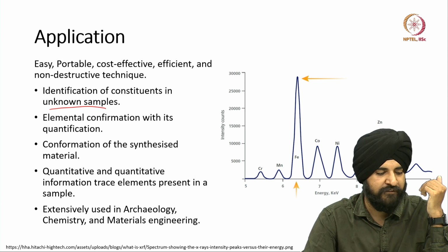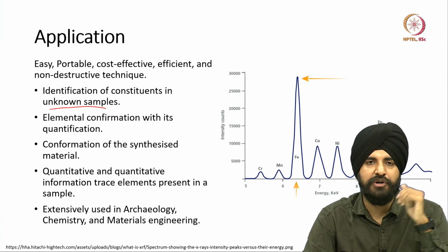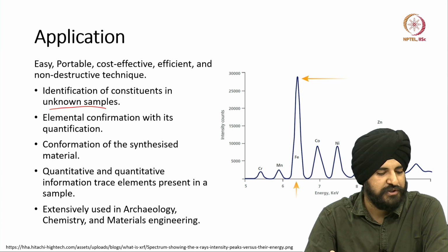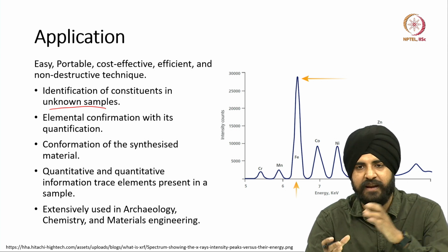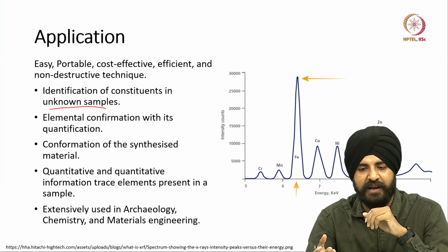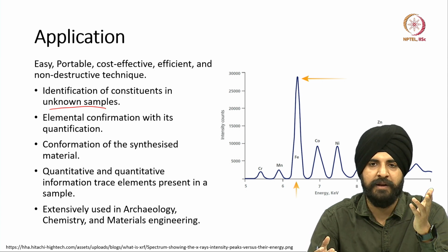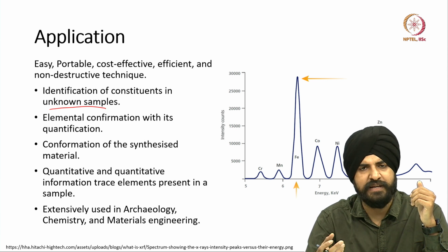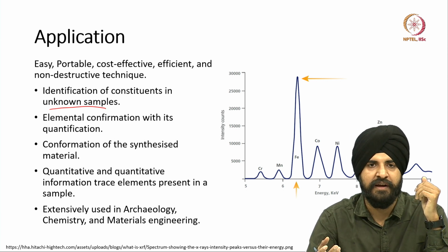Basically, let us talk about the advantages of XRF. The advantage of XRF is that it is a really tiny instrument, a really cost effective and efficient technique, and moreover it is portable as well. So, you can take it to a particular site, an archaeology site, and run the XRF there itself.